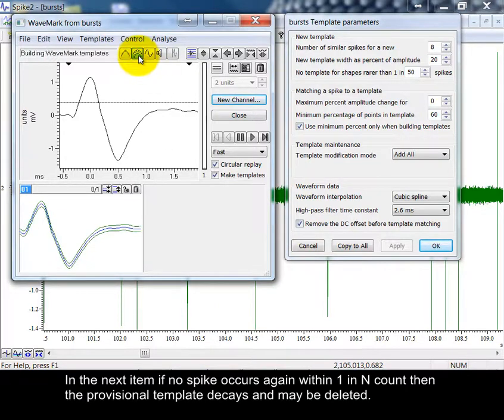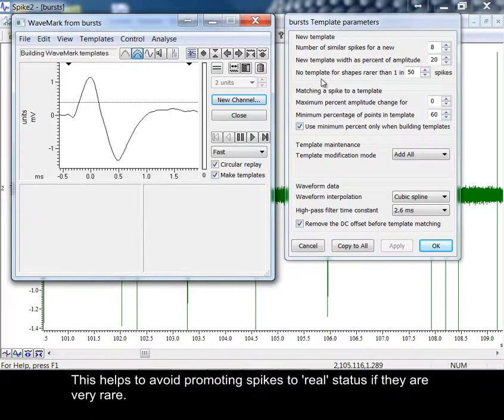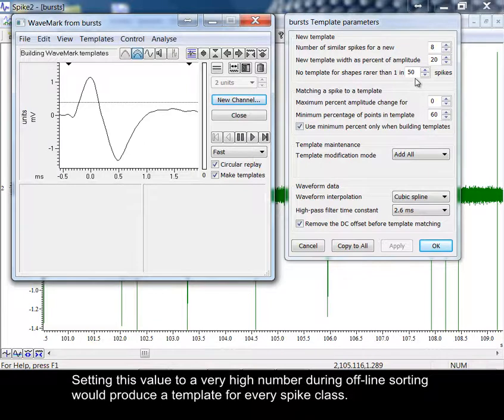In the next item, if no spike occurs again within one in n count, then the provisional template decays and may be deleted. This helps to avoid promoting spikes to real status if they are very rare. Setting this value to a very high number during offline sorting would produce a template for every spike class.